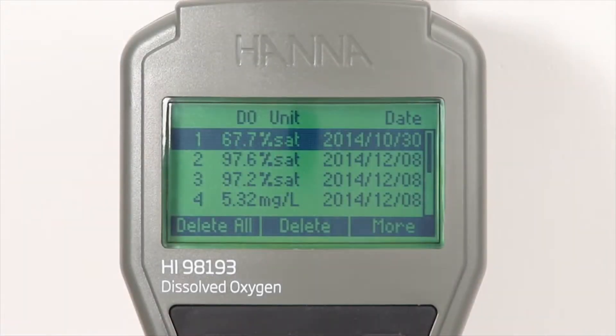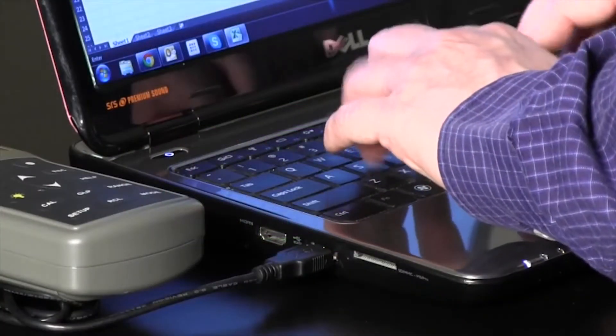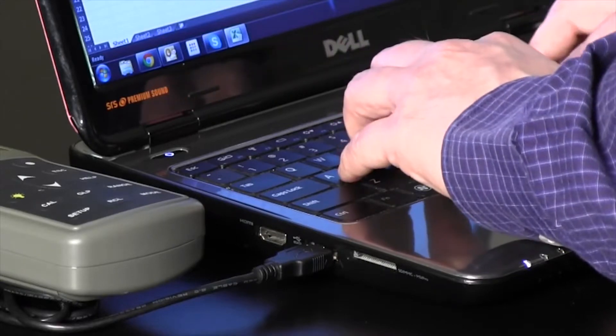Logging data is made easy with a simple press of a button. These logged measurements can be transferred to a PC using the supplied Windows compatible software and USB cable.